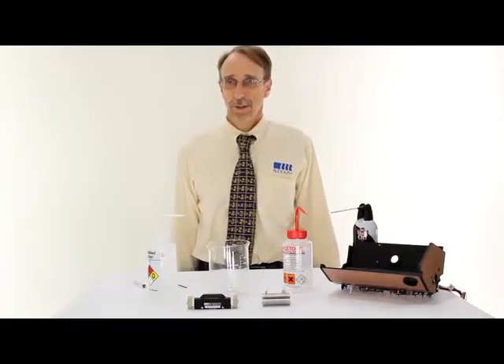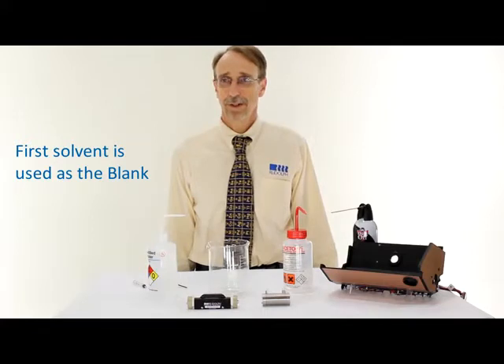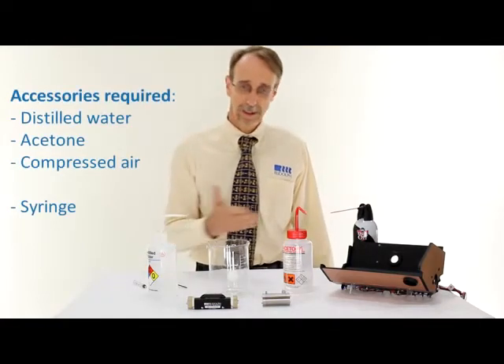Before starting the process, suitable solvents need to be selected. Often two solvents are used: one that will remove the sample, and another that will remove the first solvent. Since this cell had sucrose in it, I'm going to use water and acetone.